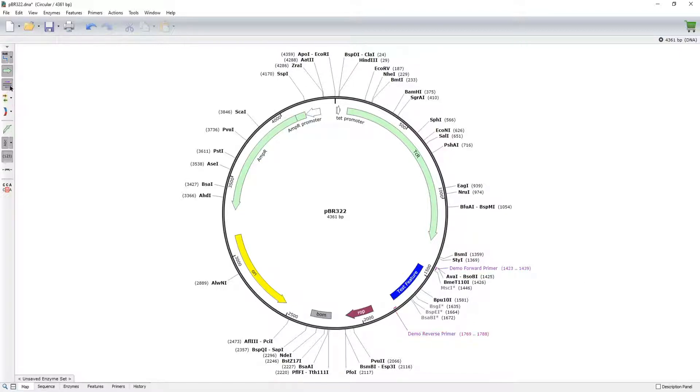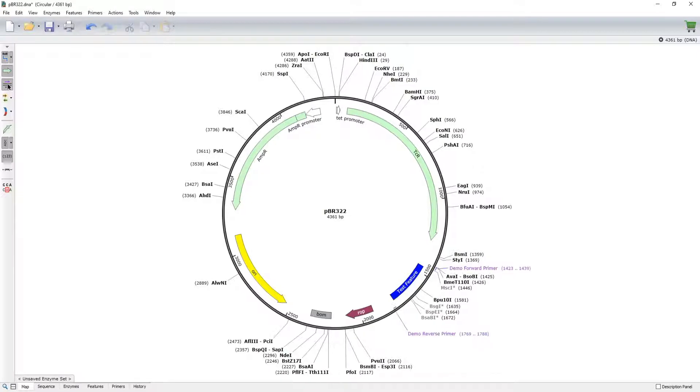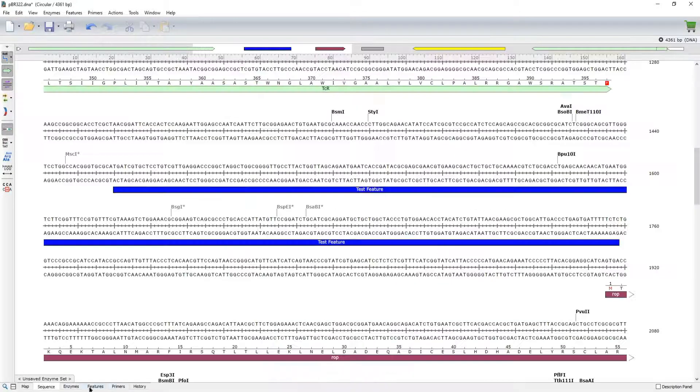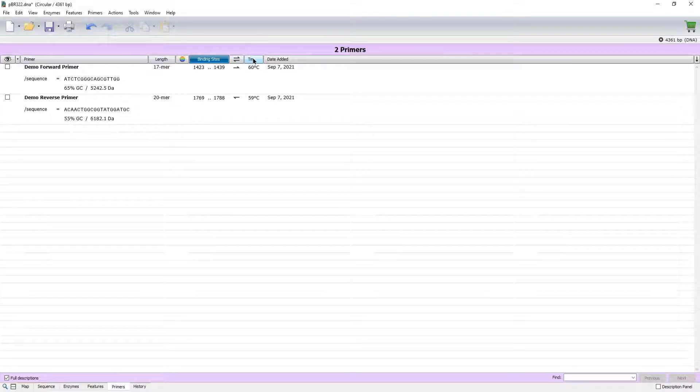As with other annotations, you can toggle primers on and off from the sidebar, and you can view a complete list of the primers in your sequence via the Primers tab.